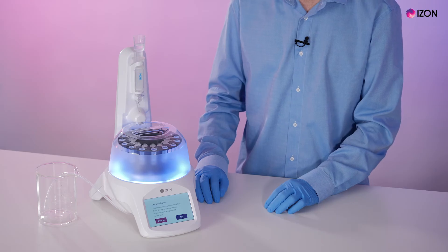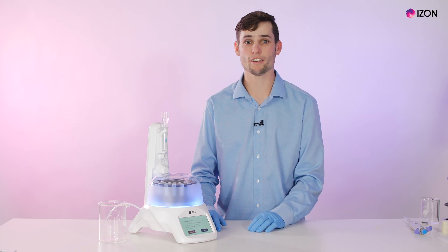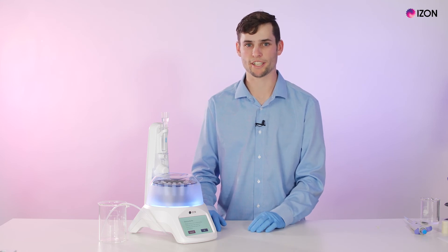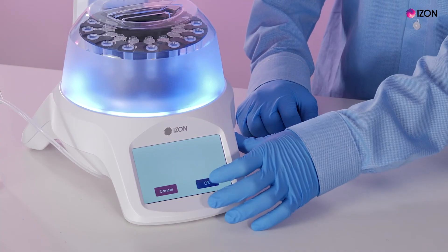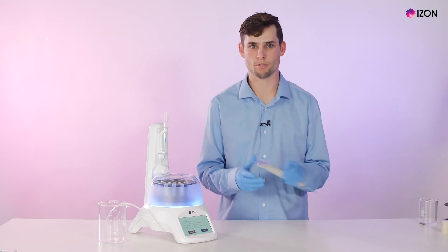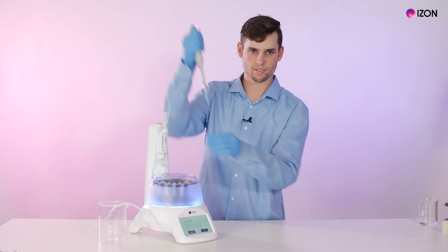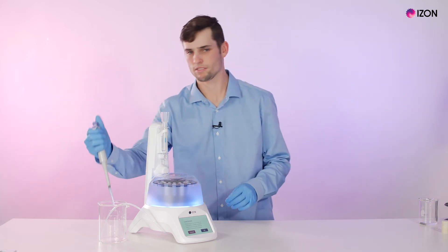The next screen will prompt the user to put the carousel cover on the AFC, which I have already done. The cover protects the carousel from being inadvertently bumped during operation. Make sure there's sufficient buffer volume available and press OK. Ensure there is no residual buffer on the top of the column before loading the sample, then load the sample and press OK.